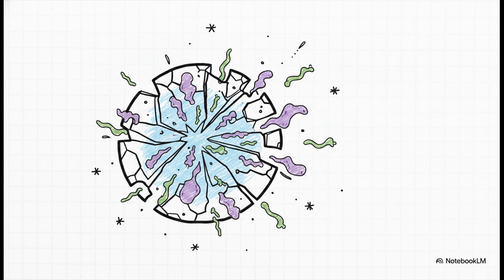But wait, there's a catch. All of that beautifully preserved material, it's still trapped inside the cell. So next, the cell membranes are lysed, which just means they're chemically busted wide open, releasing this cross-linked chromatin out into the open so the DNA can be cropped down to size.